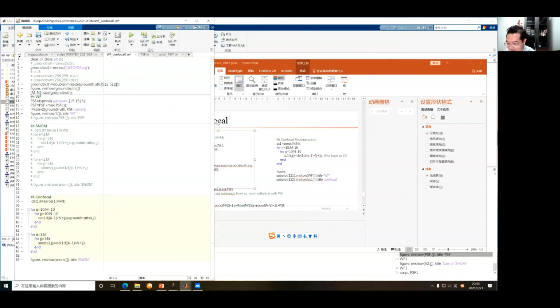And minus 10. So each detector 1D would be a sum of the PSF. This PSF will be the 2D responses. My Gaussian ground truth, I have to give it the same coordinate.